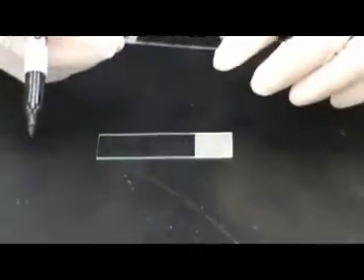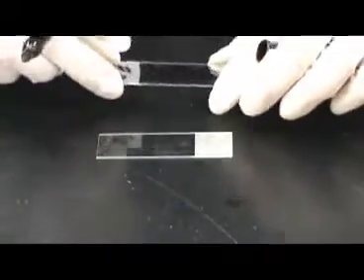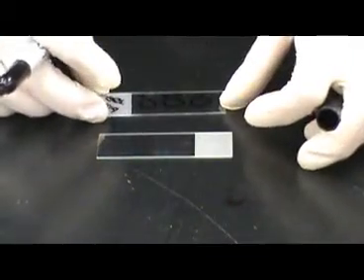After labeling your slide, flip it upside down so the labels are on the bottom. You do not want the ink to get washed into your bacteria during staining. Now, on a clean slide, place some clean water. Distilled or deionized water is fine.